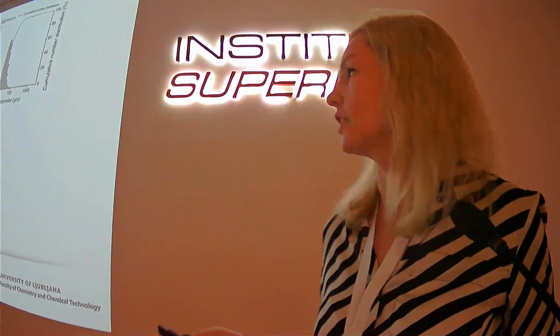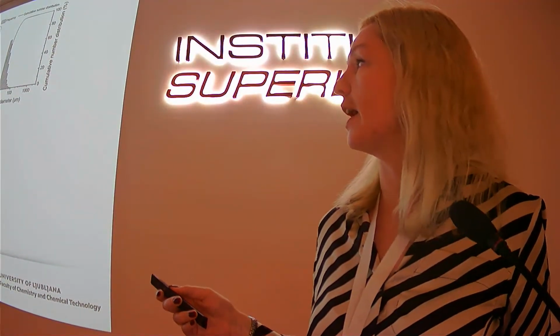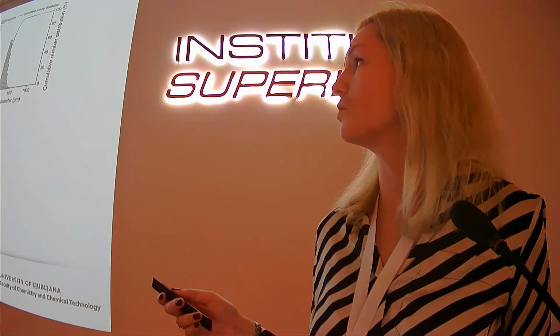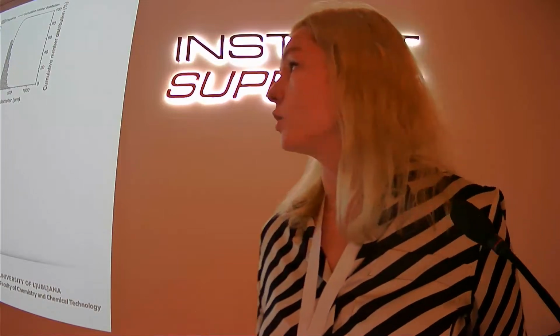And then we did size analysis with the laser diffraction analyzer, and we got this distribution, and the mean number from the number particle size distribution was actually that the majority of particles were 23 micrometers, so much smaller. And it's like, okay, so what is happening? And then you can actually see it here.